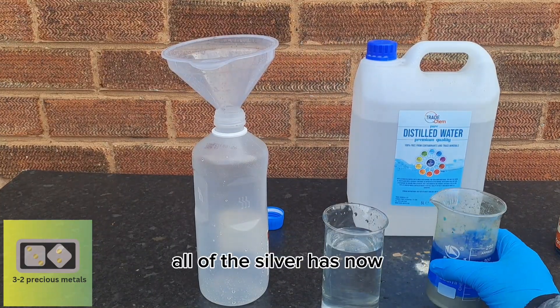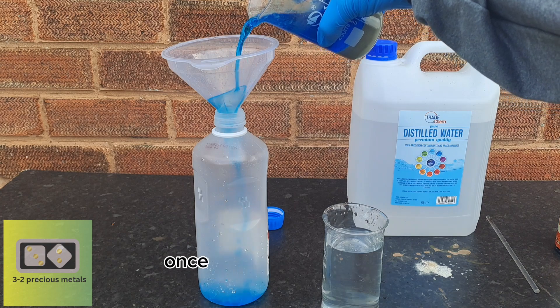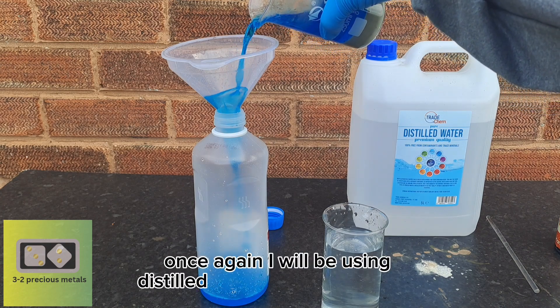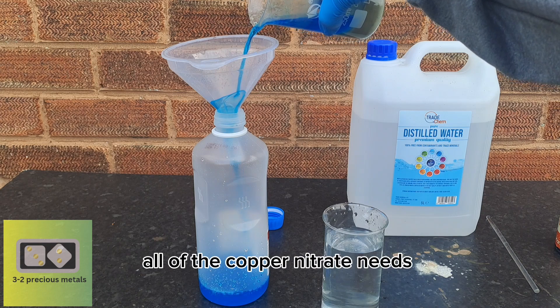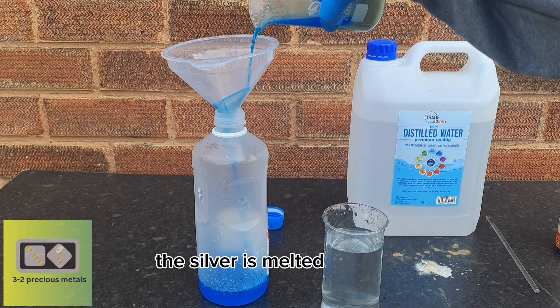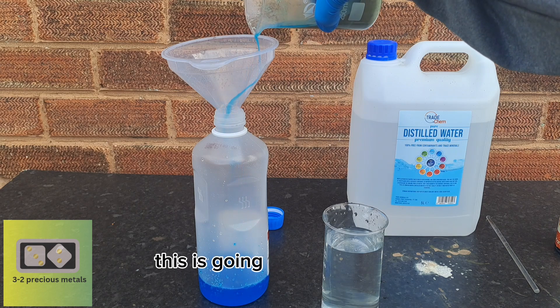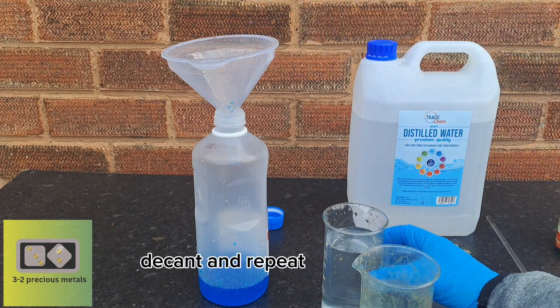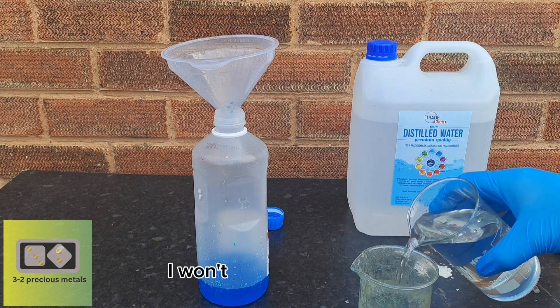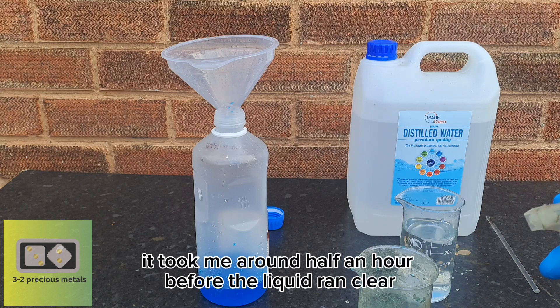All of the silver has now cemented out of the solution, and it's time to clean it up. Once again, I will be using distilled water to rinse the silver. All of the copper nitrate needs to be removed before the silver is melted, or it will contaminate it. This is going to be a case of rinse, allow to settle, decant, and repeat until the liquid is clear — it took me around half an hour before the liquid ran clear.